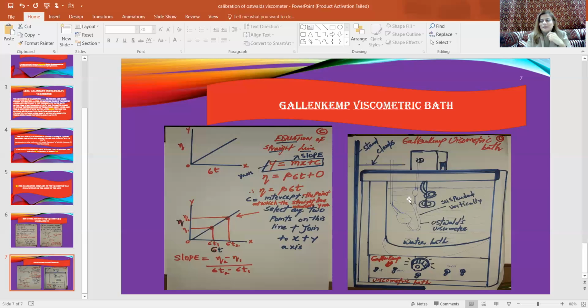So, this is the great drawing I've done. It looks the same. If you visit Dr. Mchem's Institute of Chemistry Instrumental Lab, you can see this instrument. It is a very huge, big instrument, a very heavy one, right? Its color is grayish, right?